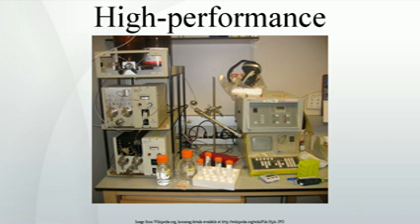Adsorption chromatography is still widely used for structural isomer separations in both column and thin layer chromatography formats on activated, dried silica or alumina supports. Partition and NP-HPLC fell out of favor in the 1970s with the development of reversed phase HPLC because of poor reproducibility of retention times due to the presence of a water or protic organic solvent layer on the surface of the silica or alumina chromatographic media.